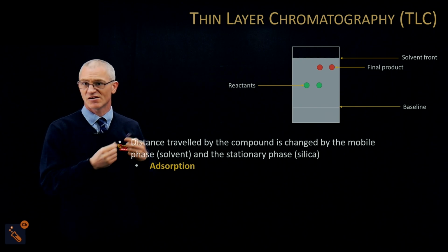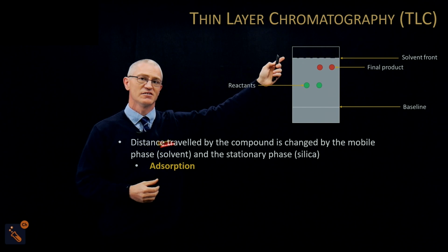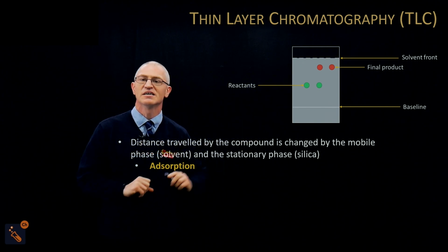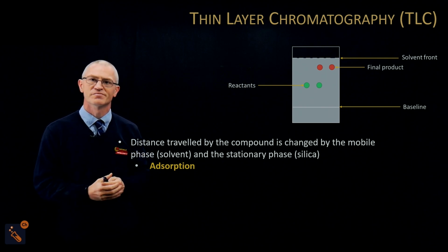Now, on the converse of that, if it's really, really not attracted, you should see it right at the top. And again, just to finish off, if it's really attracted, you should see it down at the bottom. And it's done through adsorption.